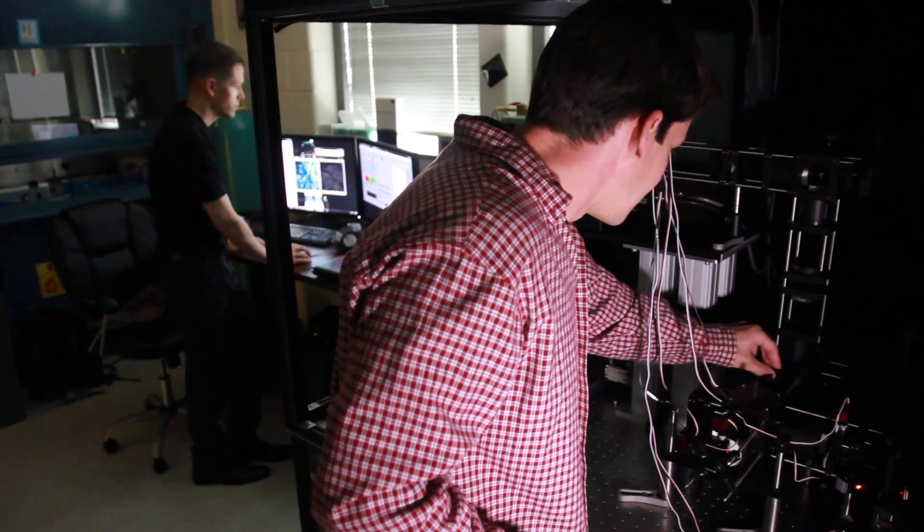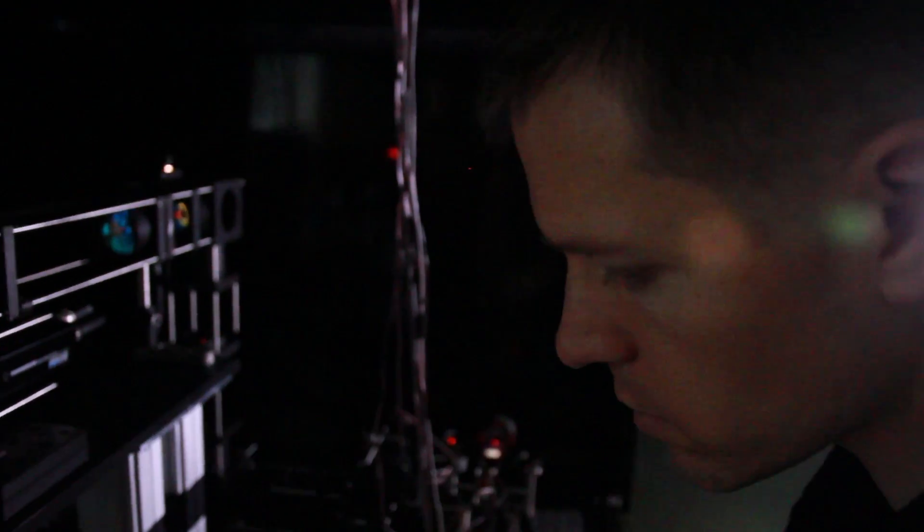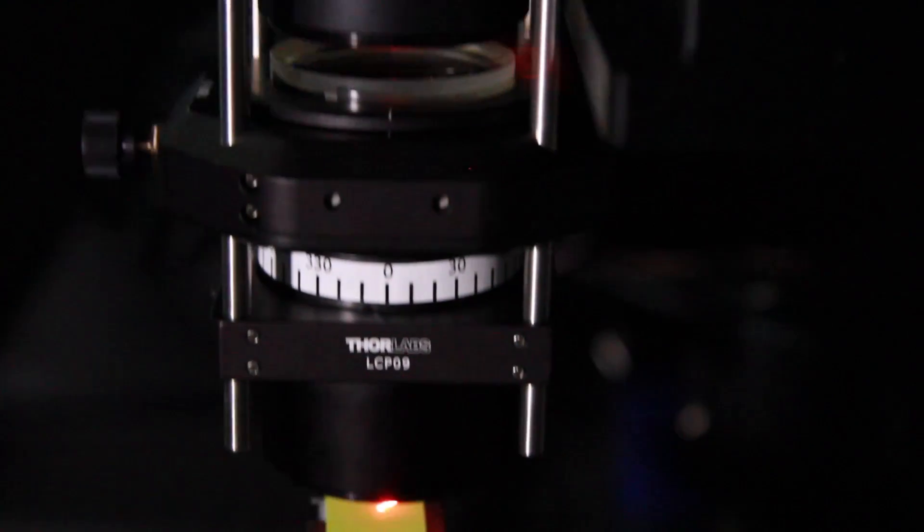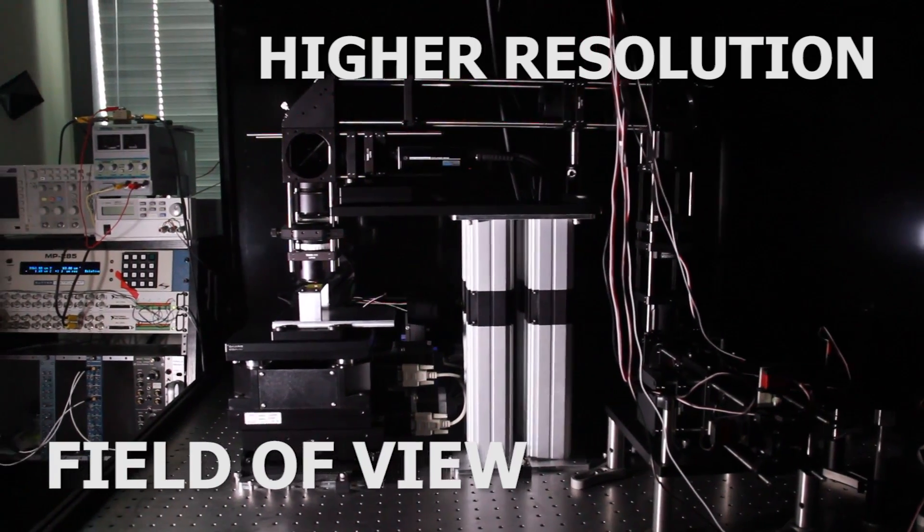So we're designing new multi-lens systems that are manufacturable and multi-purpose so they can be used in different combinations so that you can have either a larger field of view or higher resolution.